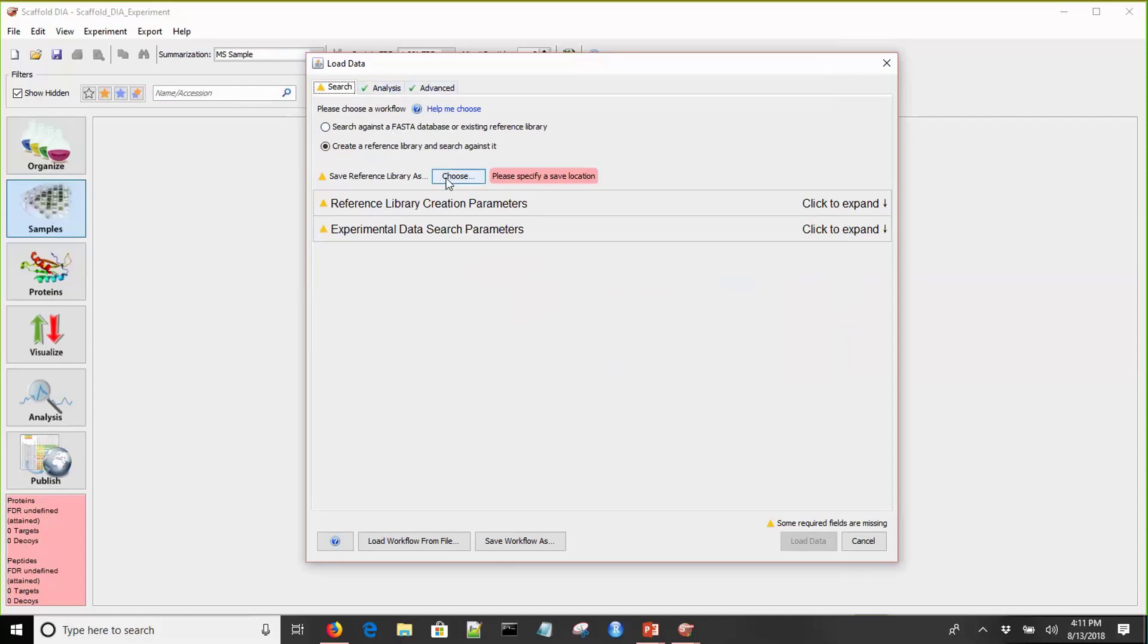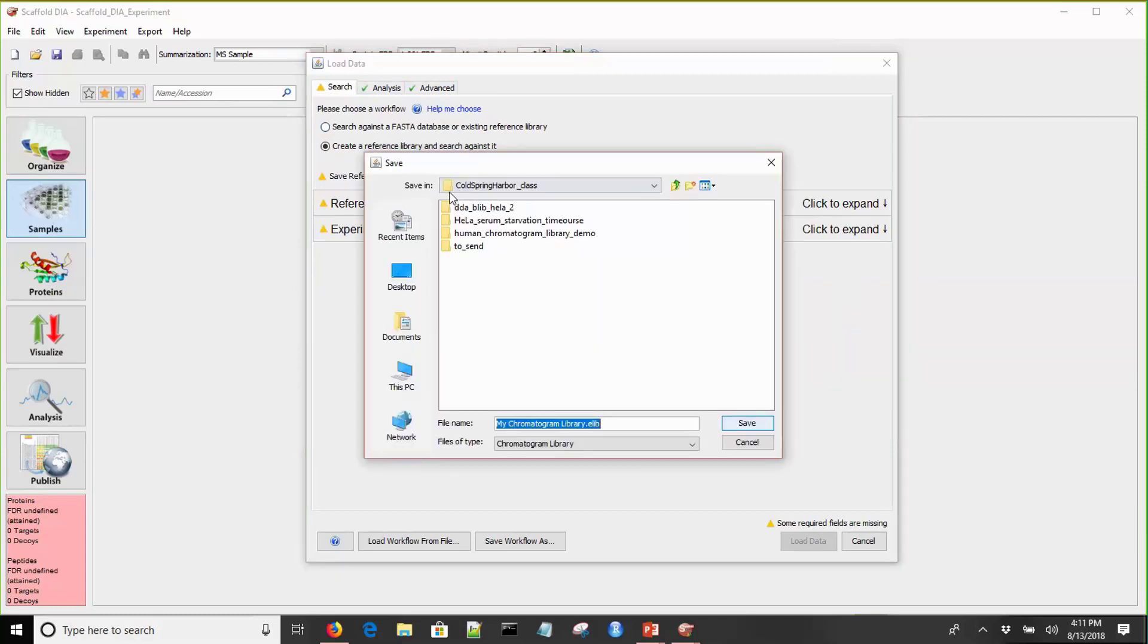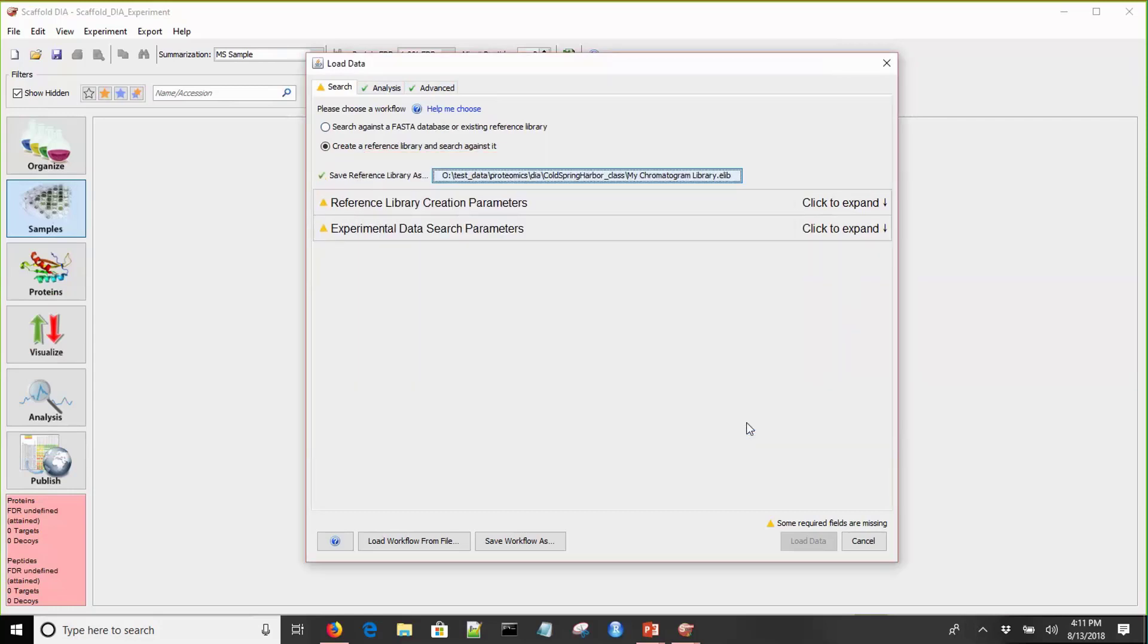First, let's save our reference library. We'll click Choose, and this will bring up a dialogue where we can choose a location to save our library and name it. We'll name it as the example and click Save.